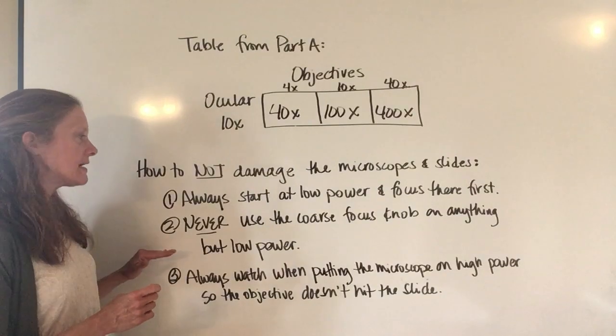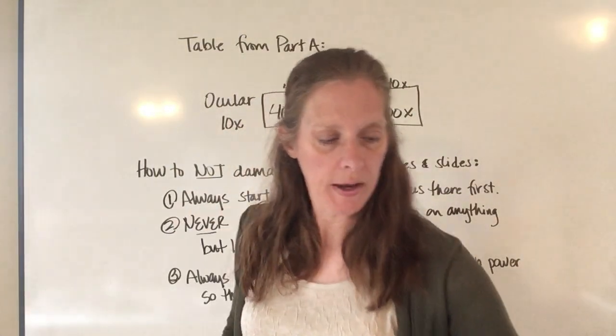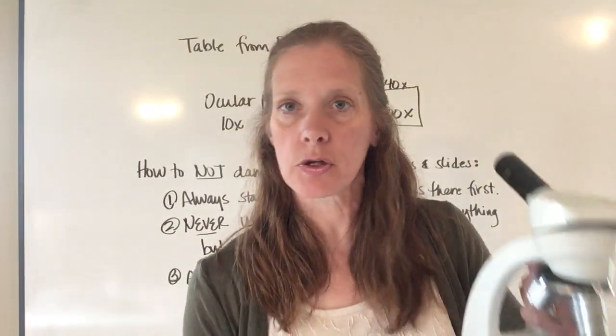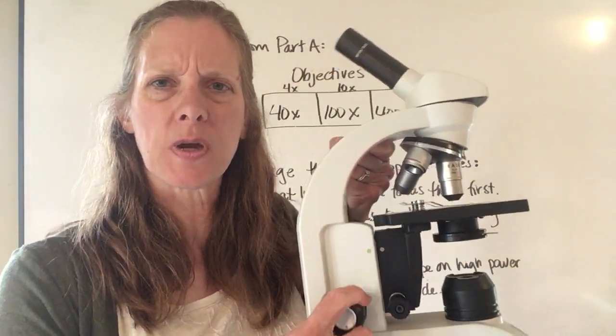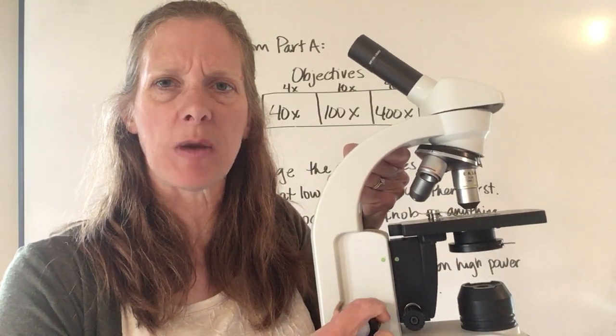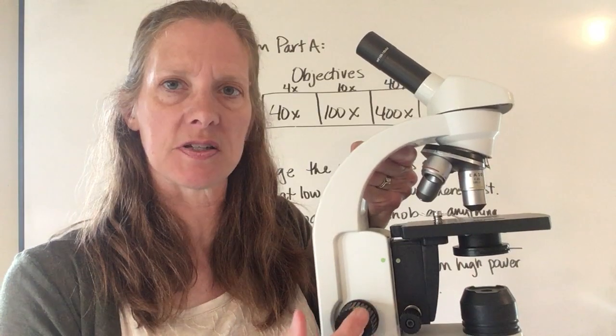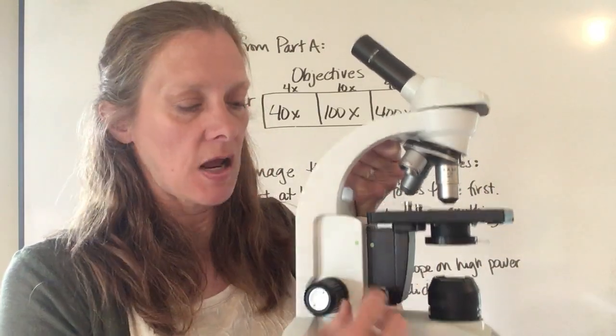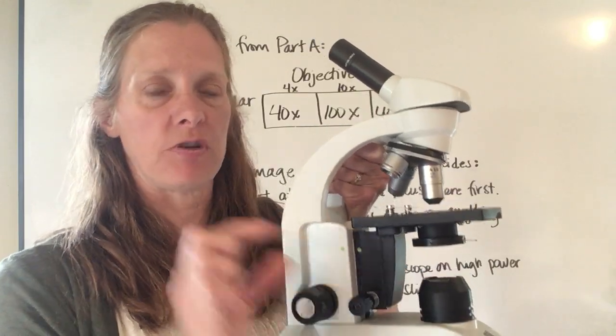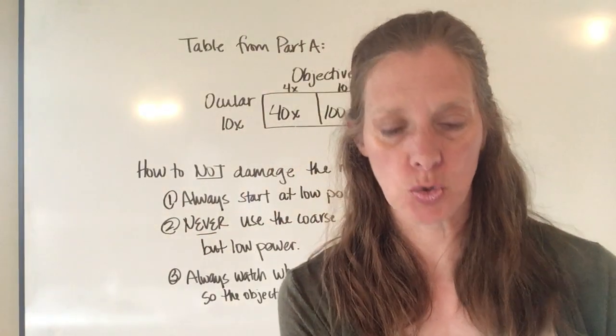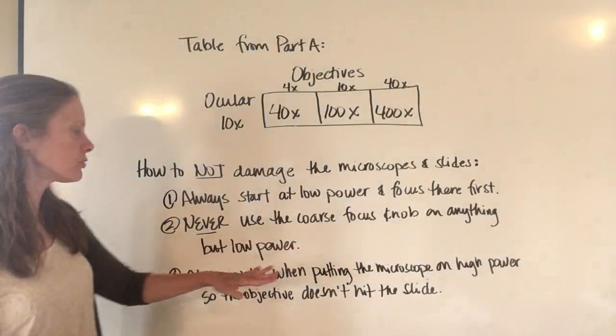Secondly, there are two focusing knobs. I can show you on my microscope; they may look different on yours. The coarse focus knob—you can see the stage move up and down. If I hold this still, you can see my stage moving as I turn this because it moves the stage a lot. The fine focus knob, if I turn it, you really can't see the stage moving because it moves such a minuscule amount.